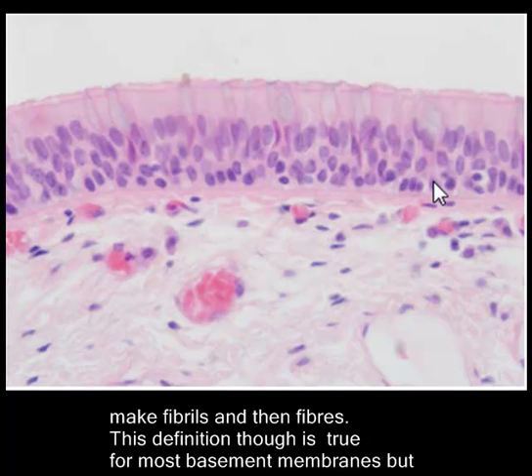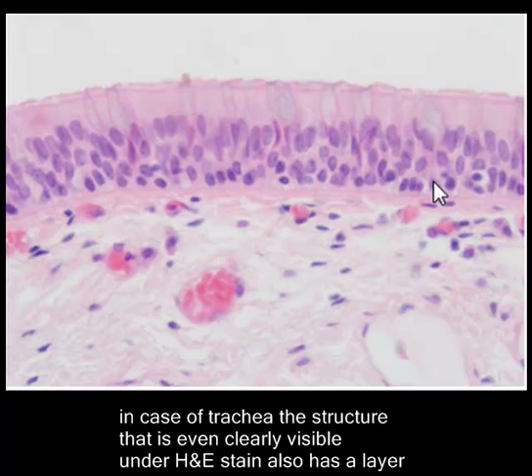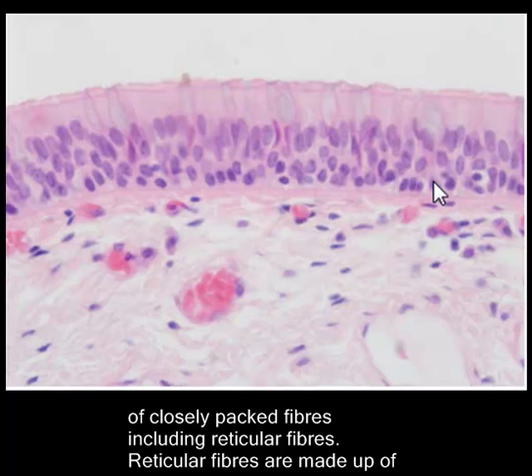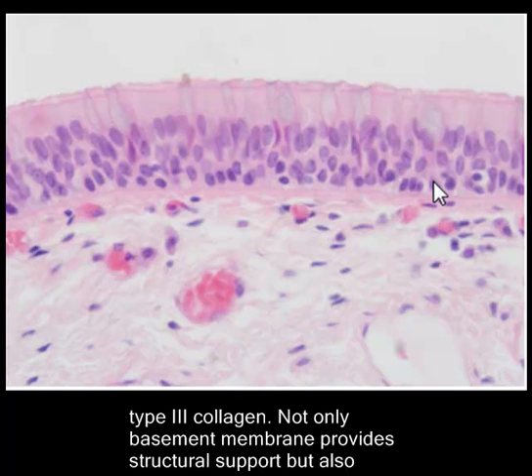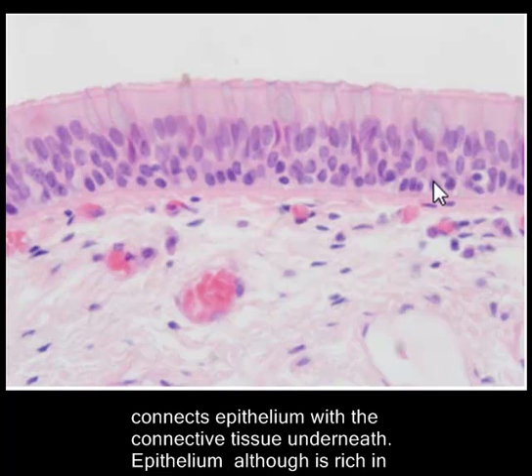In the case of respiratory mucosa, the structure that is clearly visible under hematoxylin and eosin stain also has a layer of closely packed fibers, which includes reticular fibers. Reticular fibers are made up of type 3 collagen.